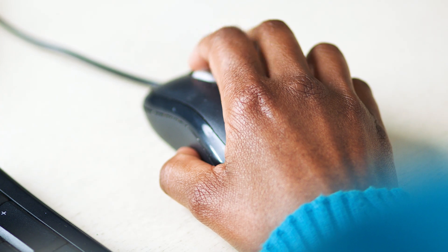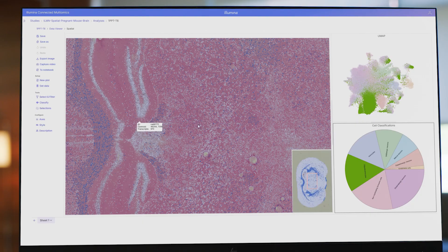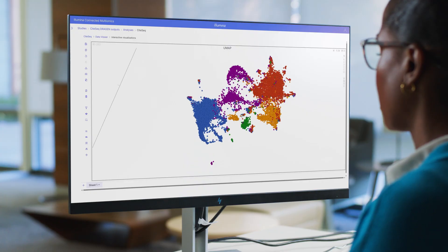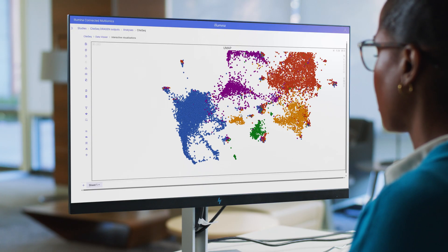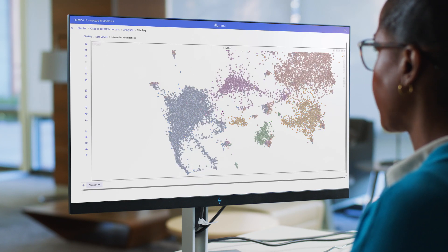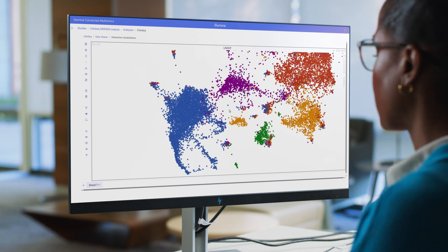Illumina Connected Multiomics makes exploring my data so easy. With its graphical interface, I get to explore data at my own pace and have more productive collaborations with my bioinformatics colleagues.